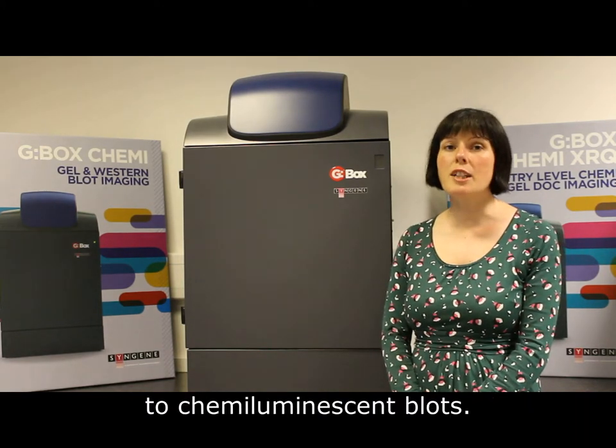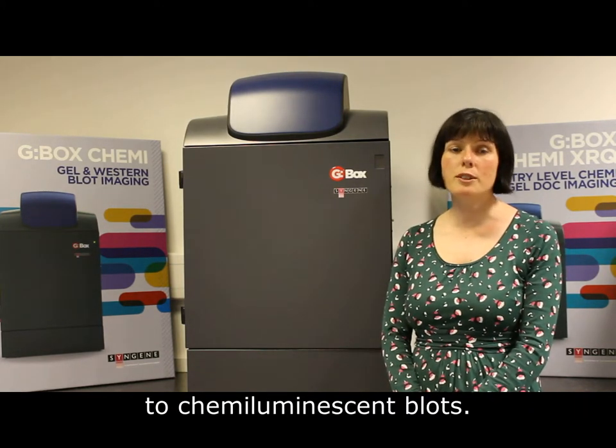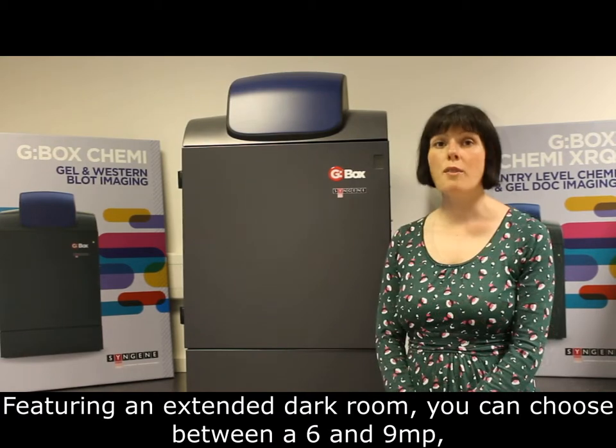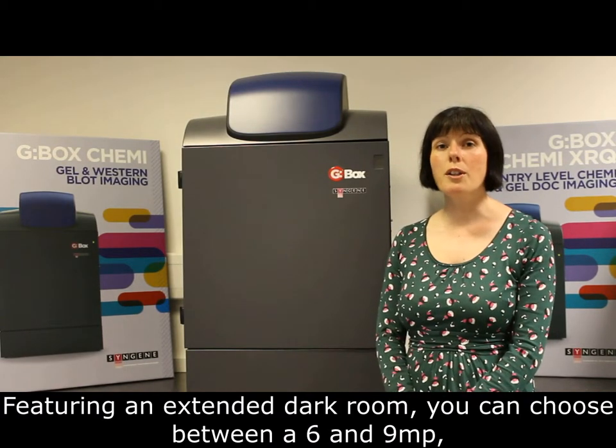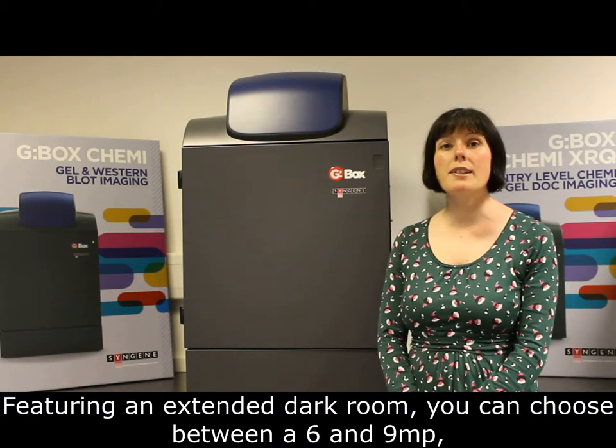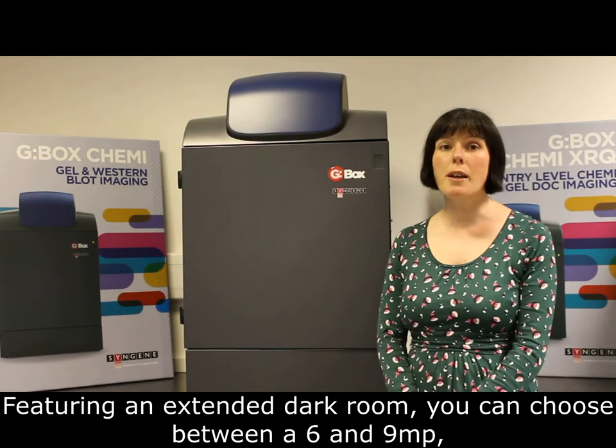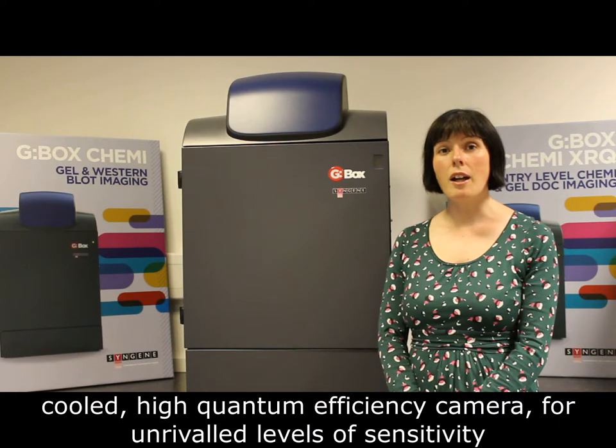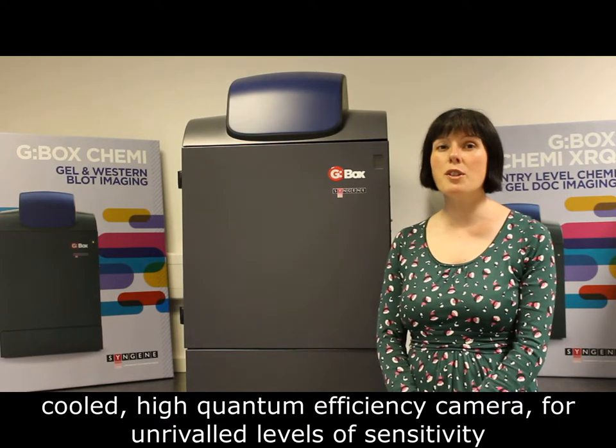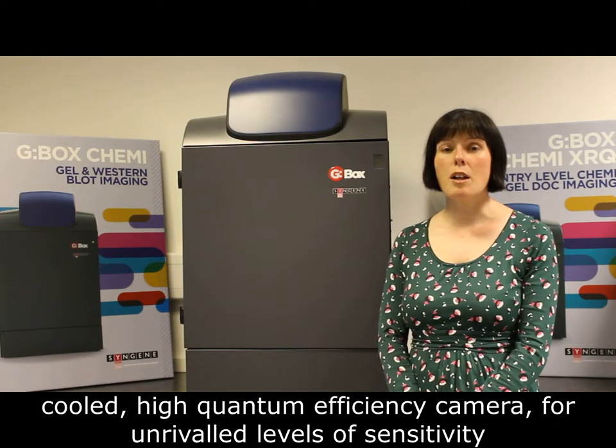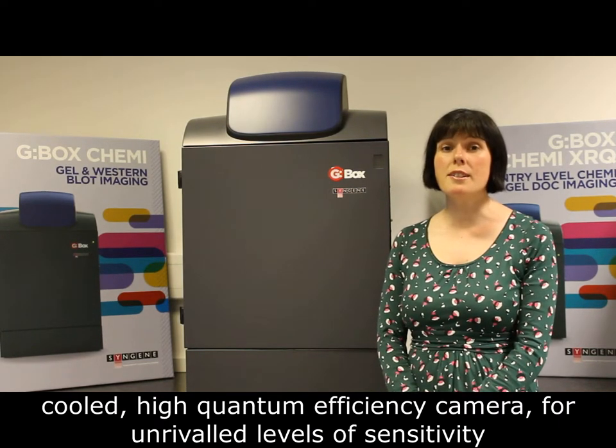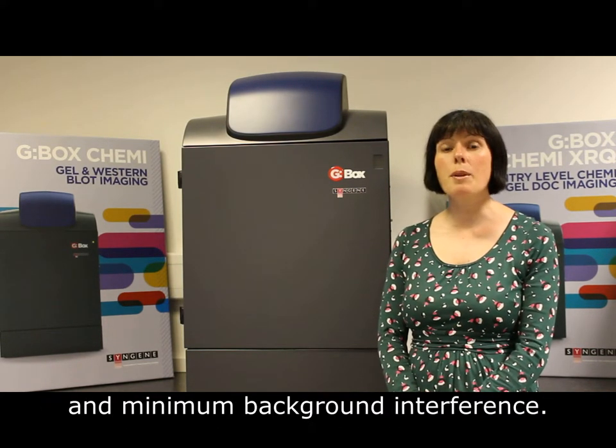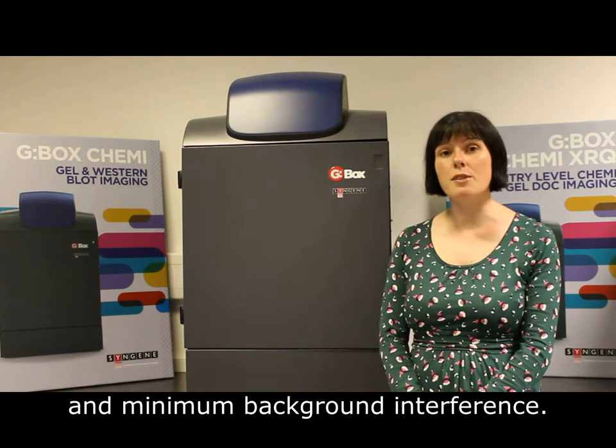and 2D gels to chemiluminescent blots. Featuring an extended darkroom, you can choose between a 6 or 9 megapixel cooled high quantum efficiency camera for unrivaled levels of sensitivity and minimum background interference.